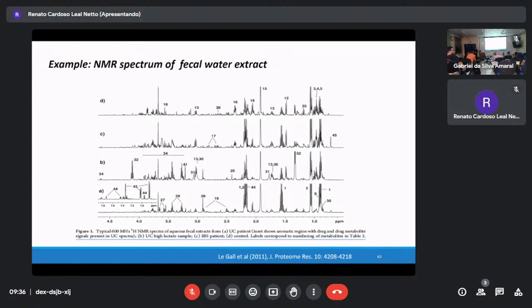All the steps are pretty much the same: preparation, centrifugation, protein precipitation, dilution, everything you can use. Then what's your name? My name is Isabel. Isabel. Then now you have a milk sample. So before planning, what's the first step? Great.